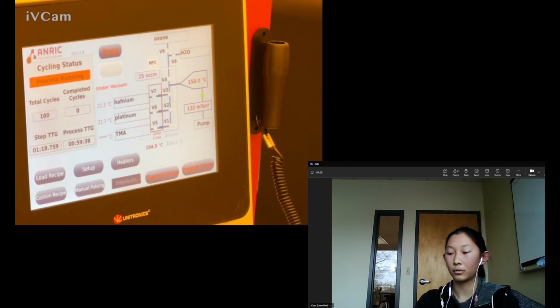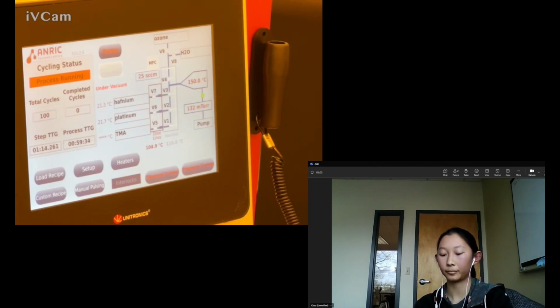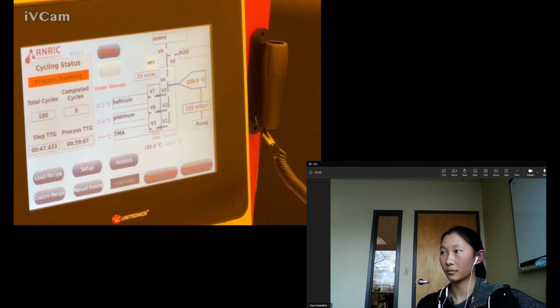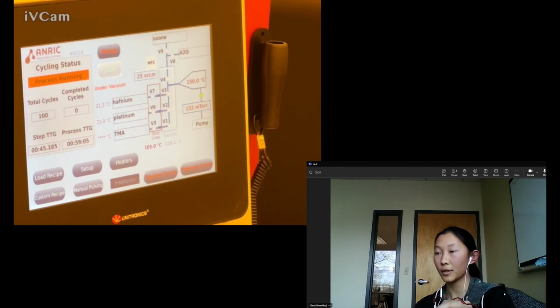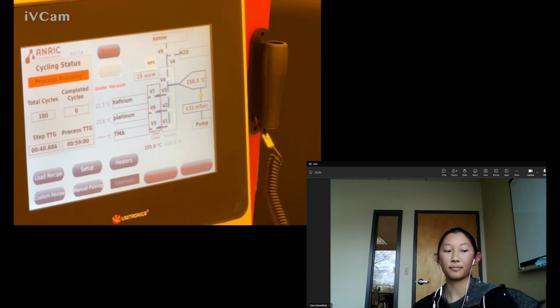Okay. And 10 nanometers takes 1 hour. 5 nanometers will take half an hour. Okay, so is the process started now, you think? In 45 seconds. Oh, in 45 seconds. Okay.